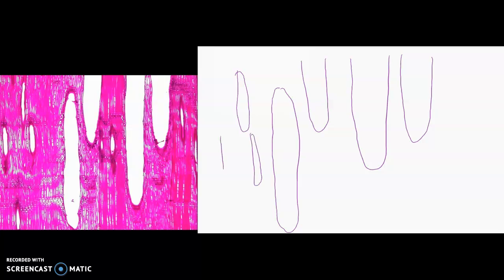And then what is interspersed between the vessels, there's actually maybe a tracheid. We can see some smaller tracheids perhaps here. You'd really have to look at those ends to see how tapered they are. If we imagine looking up closer, that tracheid that you're spotting there should have long tapered ends.